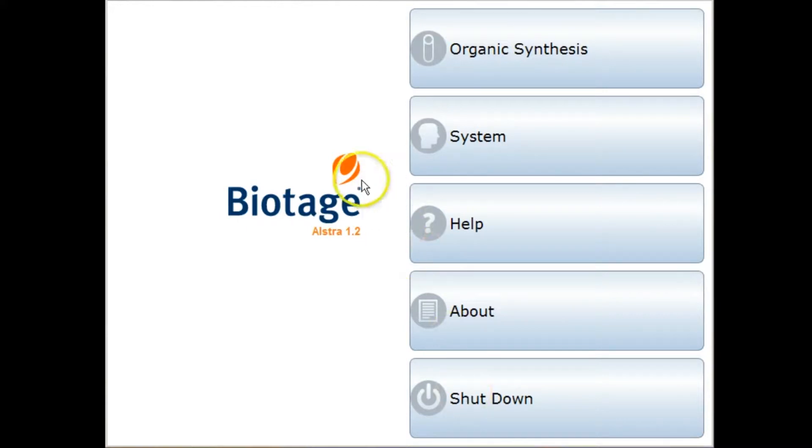This is the screen you get when you turn on the system and all we need to do is press organic synthesis to get started.